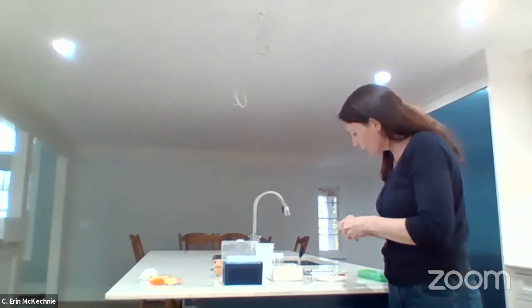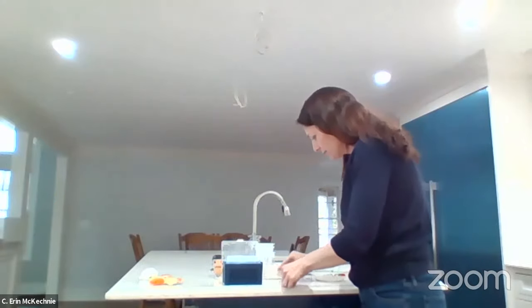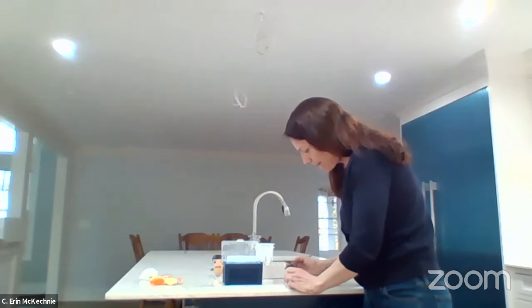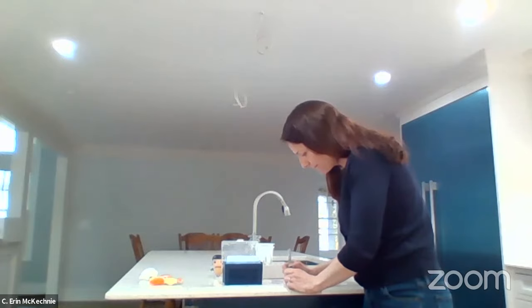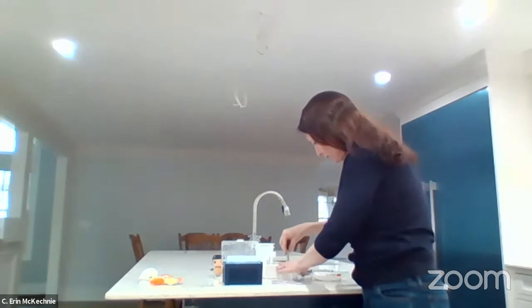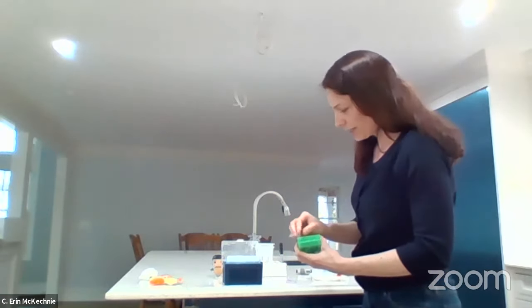So I'll take 2 tubes right here. They happen to be the same color. It doesn't matter what color tubes I use. I'm going to label one number 1 and one number 2 so that I can tell the difference. Just going to use a regular permanent marker for this. Okay. I have this little rack over here that I find very helpful, just to hold and organize everything.